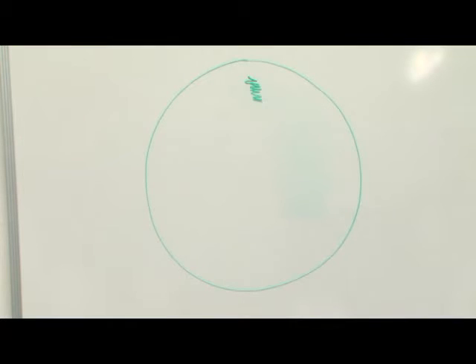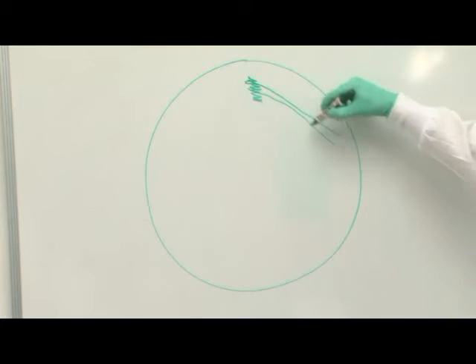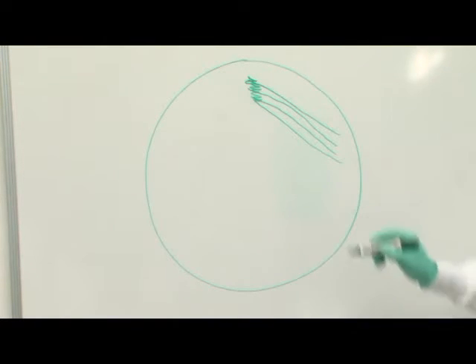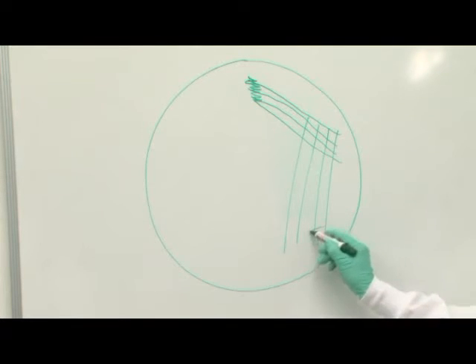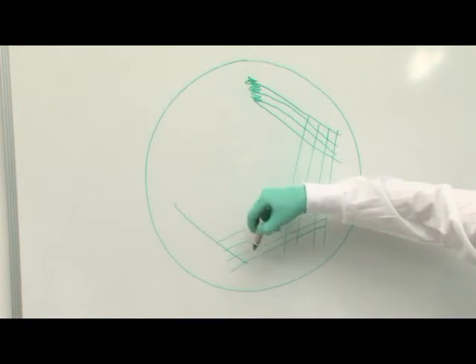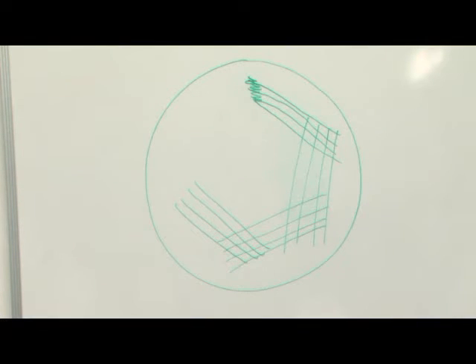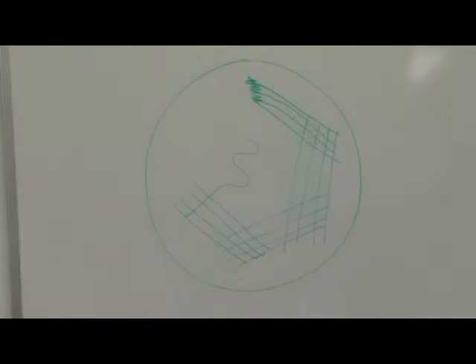successive quadrants. The first 4 streaks would show heavy growth, producing a lawn of bacteria. The second 4 streaks would show less dense growth than the original area. The third 4 streaks would show weak growth, perhaps a few isolated colonies, while the fourth 4 streaks should show isolated colonies. A final streak into the center of the plate will ensure isolated colony growth.